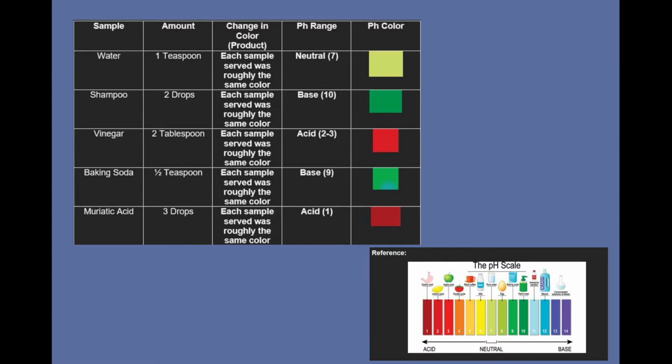We created a table in which we compared each sample more neatly and clearly. In the experiment we presented, we followed the guidelines to make the outcome more accurate and realistic. So we can see in the experiment that each sample has a base in which we use water. We can see at the bottom of the table the reference we used so we can compare all the samples. We can measure samples better and more accurately with its help.